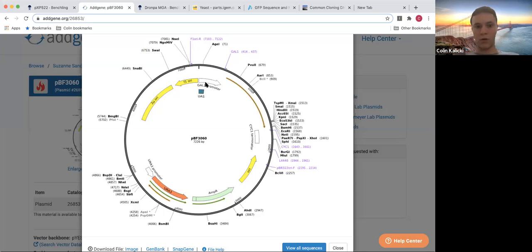And so we need to be careful with our origin site. Now, one last thing. I know I'm talking about origin site a lot, but it is super important. The origin site's also important for how many times you clone. In that code, it's going to be baked how many times and how specifically it will bind to the machinery in order to open up maybe the fork and have it repeat and stuff like that.